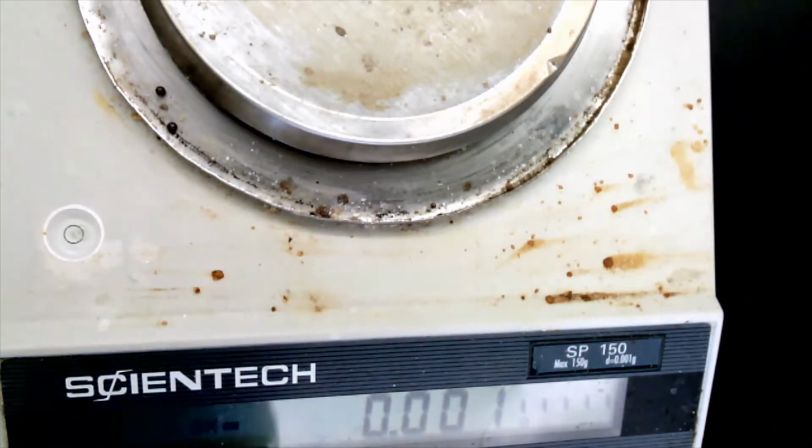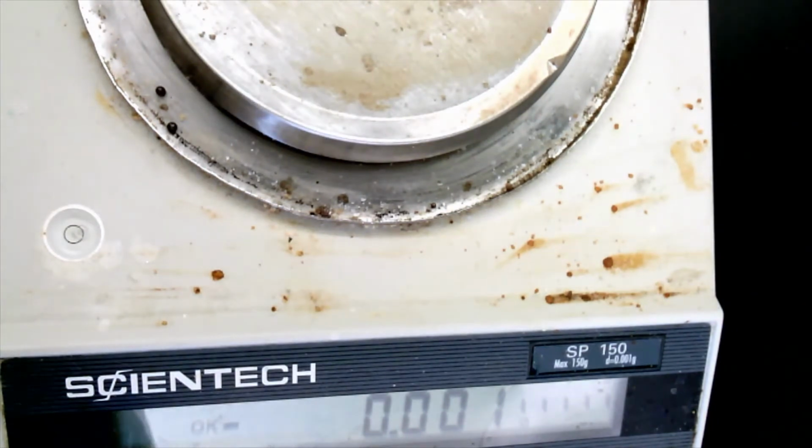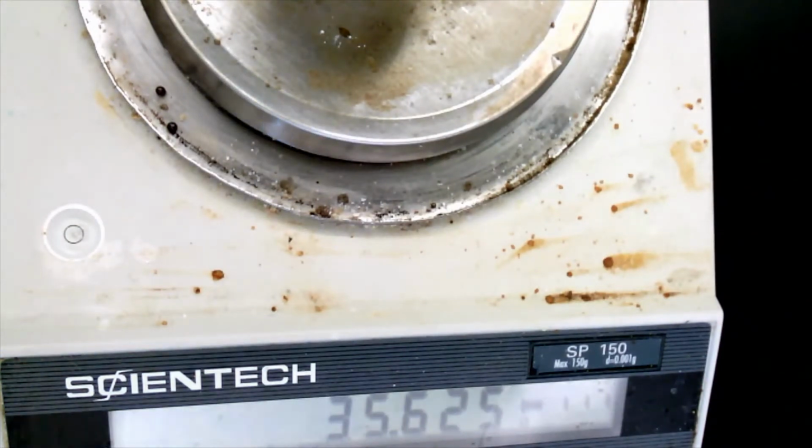Okay, so now I got my magnesium in here. I'll adjust it in a minute when I'm putting it on. Heat piece of magnesium, okay, and make sure you write down this mass.